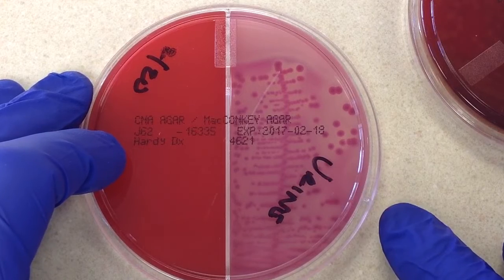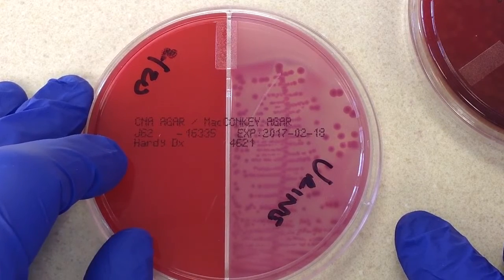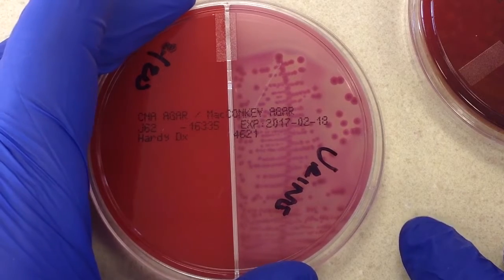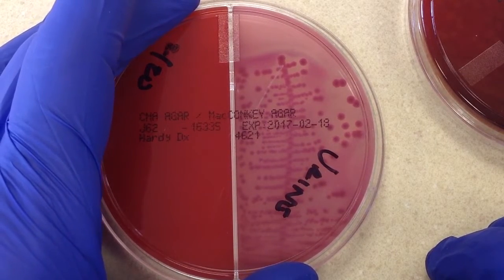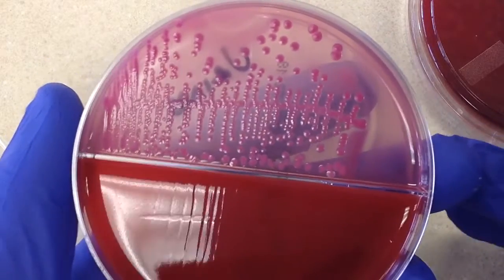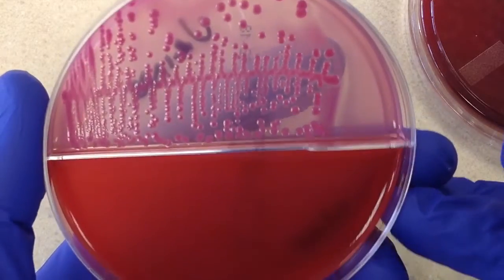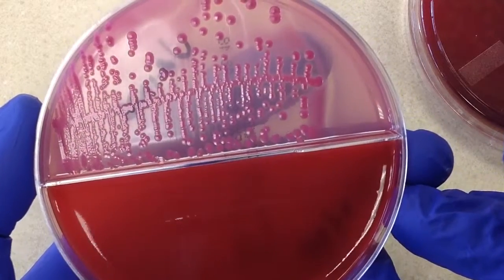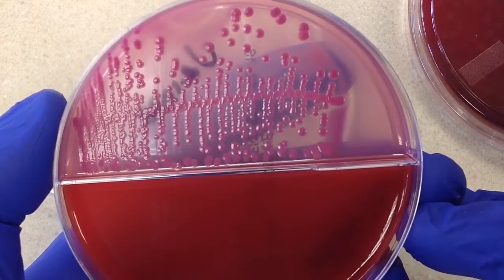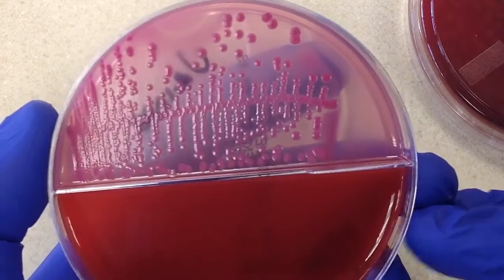MacConkey's is also a selective differential plate. It's selective for gram-negative organisms — specifically the robust Enterobacteriaceae and Pseudomonas, as opposed to the more fastidious Haemophilus. It's differential because colonies will be either pink or clear based on lactose fermentation, so whenever we look at colonies on MacConkey's we should always comment on whether they are lactose positive or lactose negative.